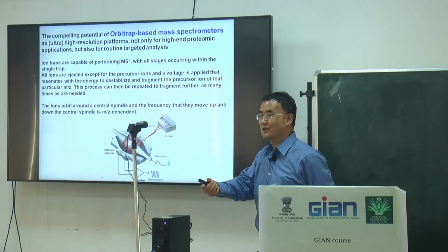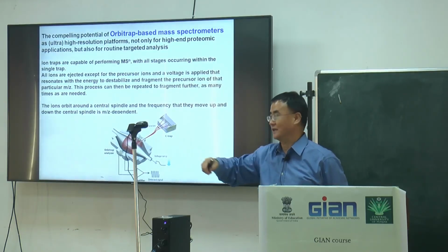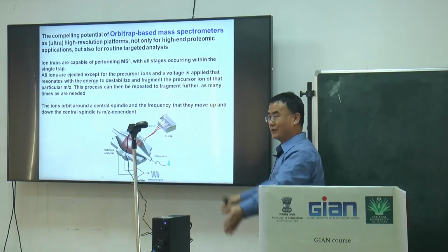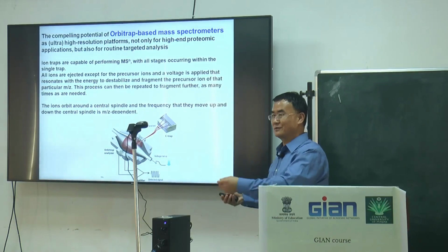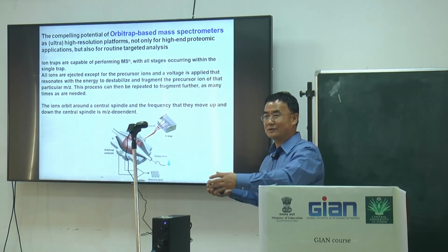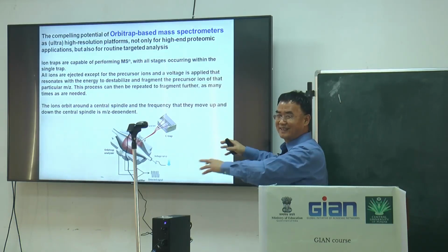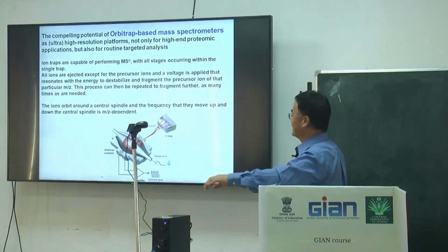One type is proteomic study. If you have a sample and want to do a proteomic study, you can use this machine. It is just a big box; from outside you couldn't see. The machine is not like an old machine, where from outside you could see the Orbitrap so long, the corridor of electric field.